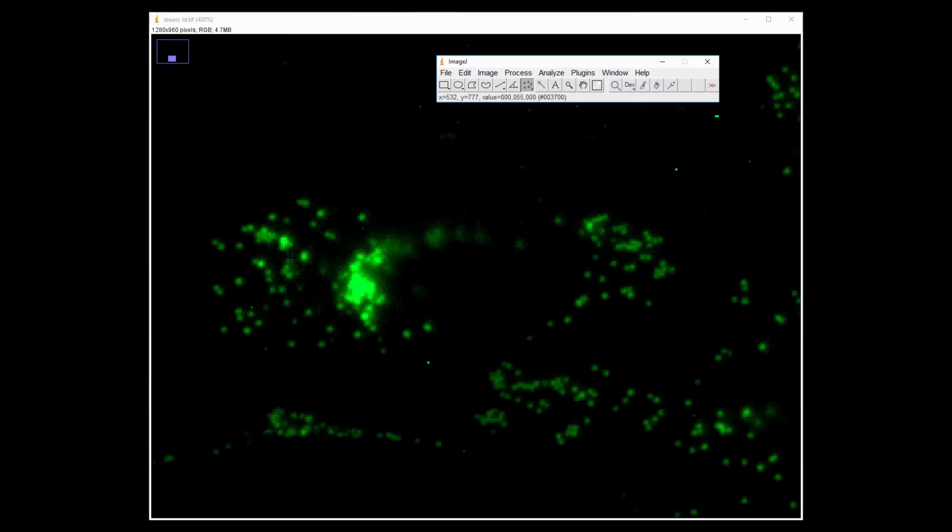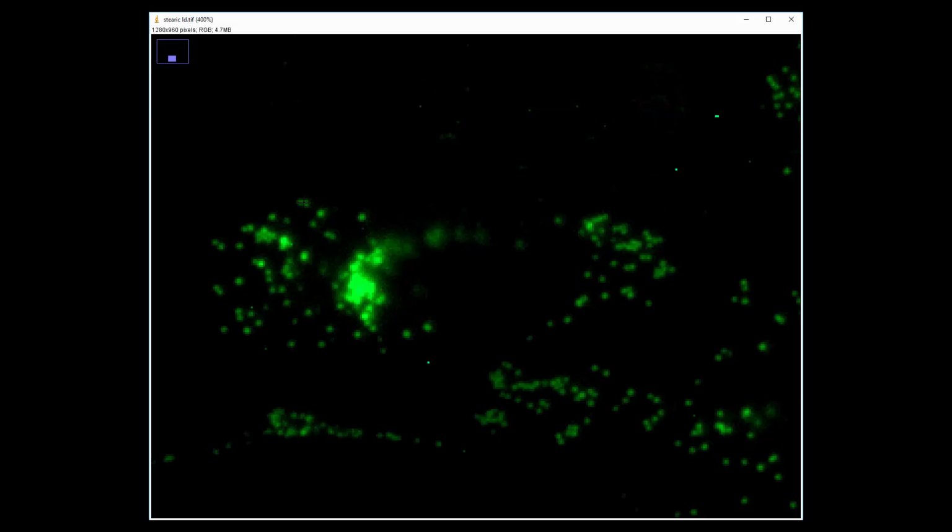And you may have to, every time you do a new cell, adjust the values, etc. But this is pretty straightforward. So we're just going to select a point, and that's 1, 2, 3, and it keeps track of it. So if you get tired and you need a break, you're just going to go through. And you can see how I'm giving all these singles where I can see distinct lipid droplet differences. And so far this has been pretty easy, right? Pretty easy.